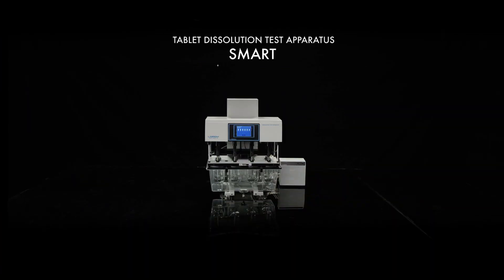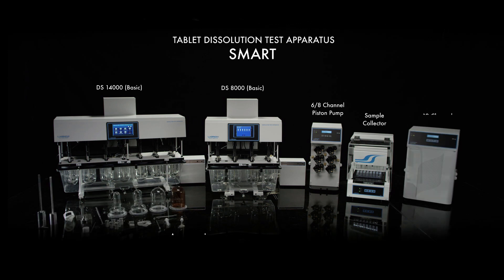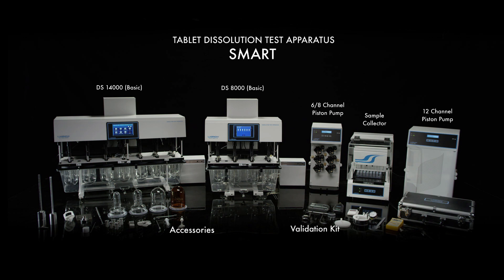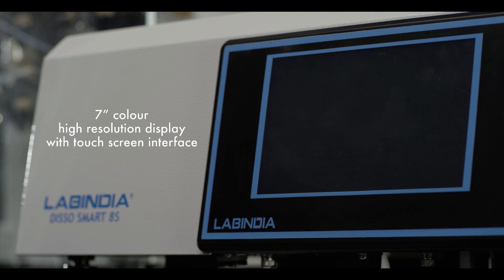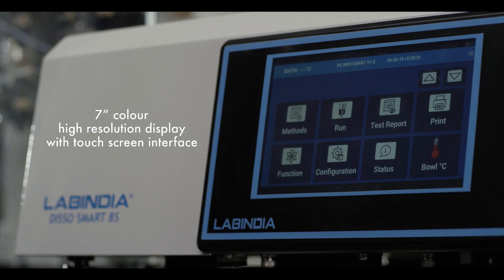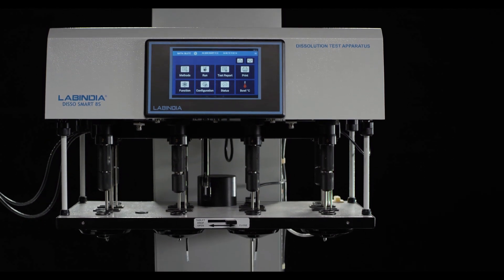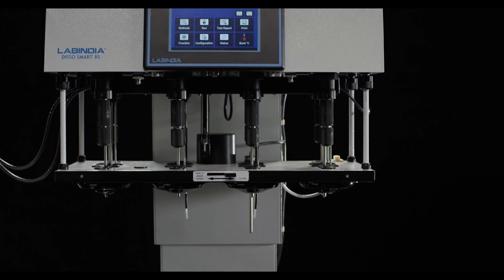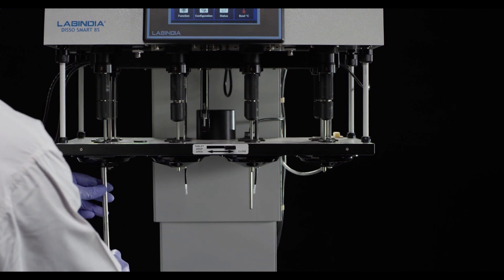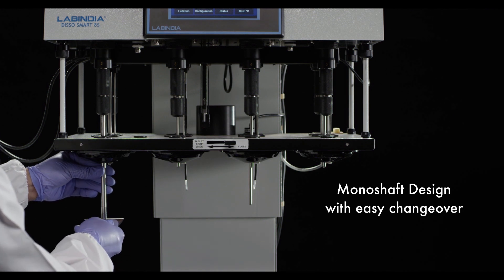Introducing the tablet dissolution test apparatus smart family from Lab India, designed, manufactured, and tested with a vision to achieve precision analysis that integrates and automates multiple other processes parallely, thereby saving time and improving efficiency. The mono shaft design with easy changeover between apparatus 1 and 2 eliminates routine height validation as per USP.